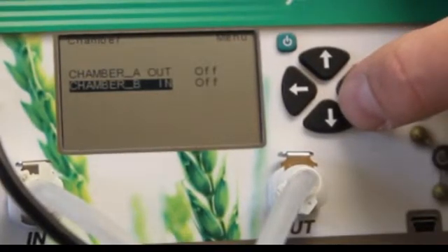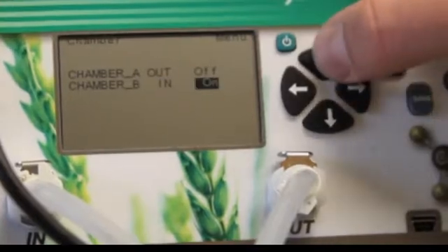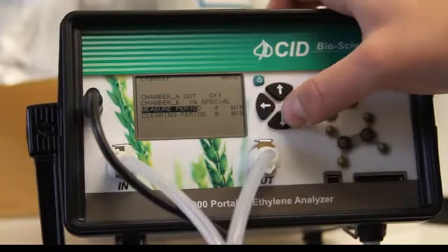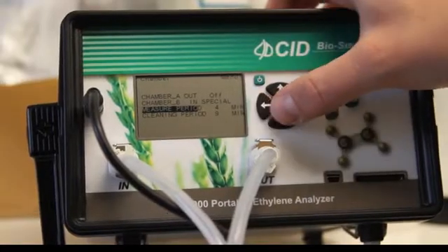Next we select chamber B in. Using the up and down arrows, we change the mode from off to special. This is where we set the time intervals for measuring and cleaning.